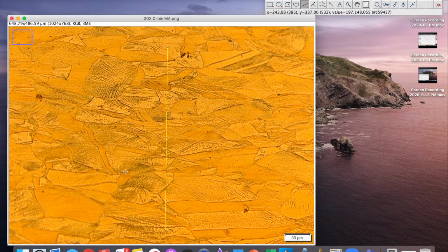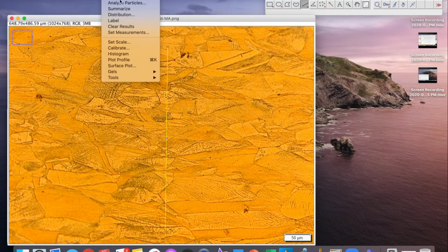So the first step, if you have a given line, the first thing I would do is calculate the length of that line. And that is something that the computer is going to do for you. So again, go back up to analysis and hit, this time, measure. You'll also see the shortcut for it too if you want to do it that way.